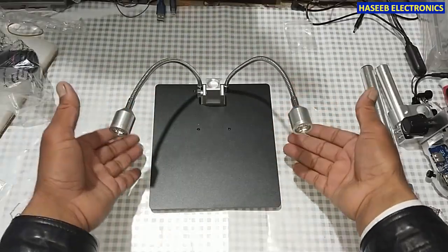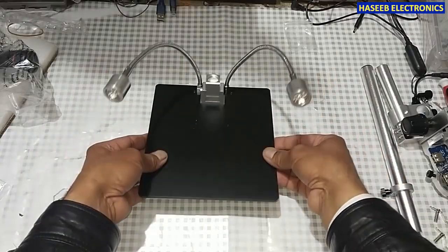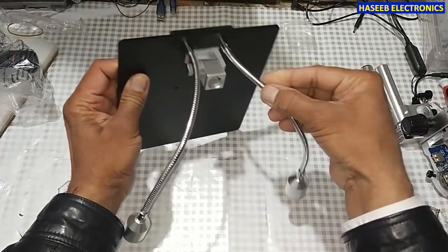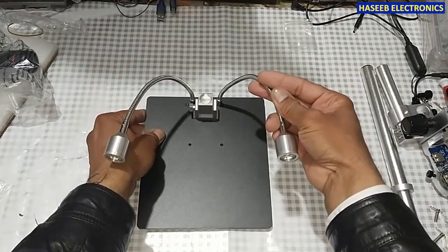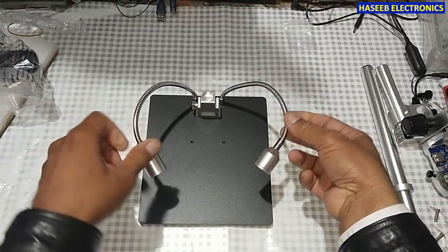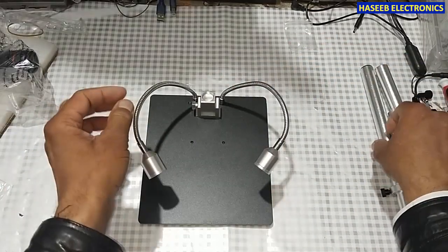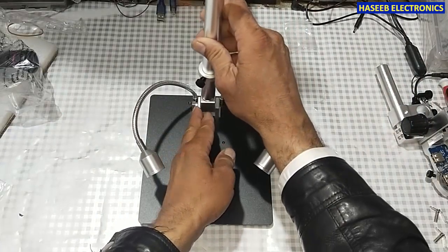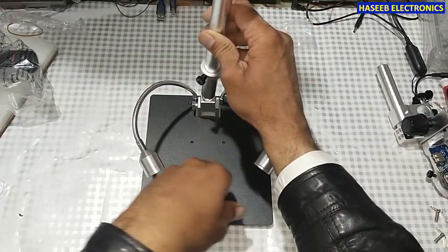Now we have this base plate. It has two LED lights to illuminate the object, and it has a mounting base to install this vertical pole.